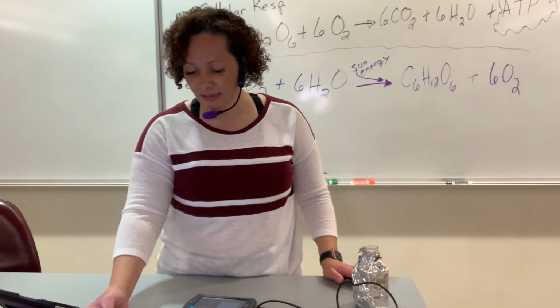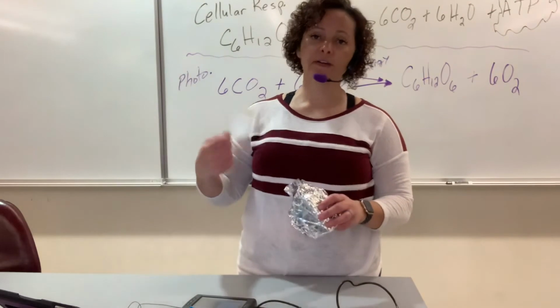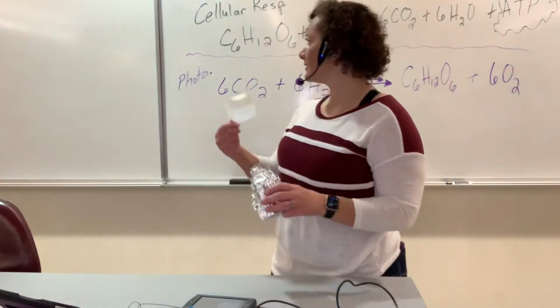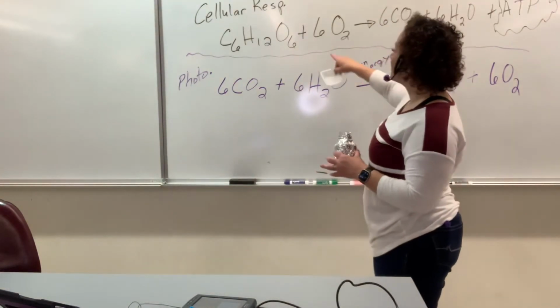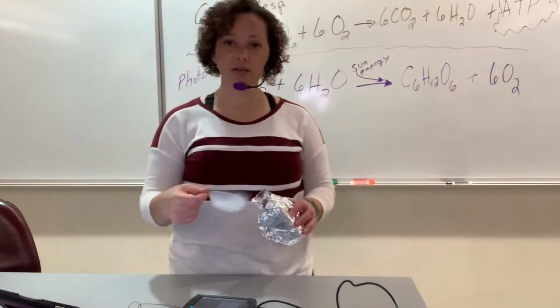Once you get all that done, you can let it breathe. And this really comes in handy. Provide it some oxygen. Why would I provide my organism some oxygen? Well, because in cellular respiration, you need oxygen. That is why. Give it a little oxygen.